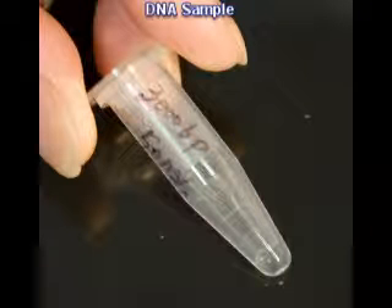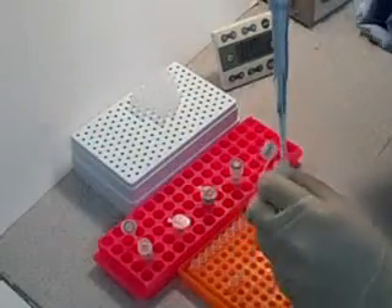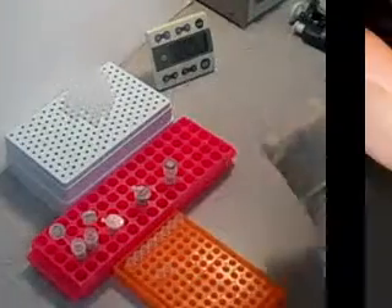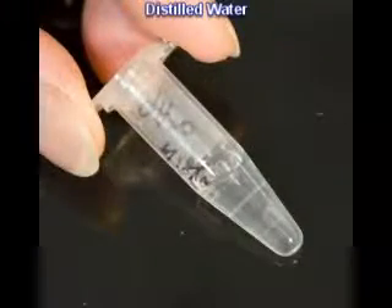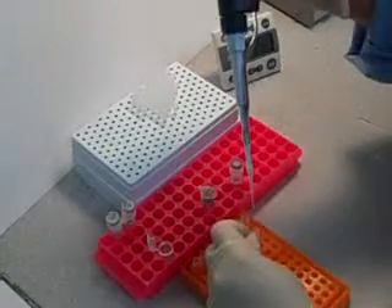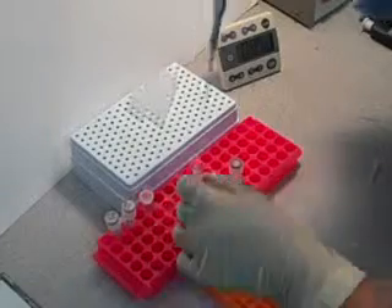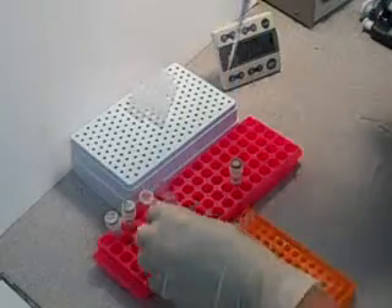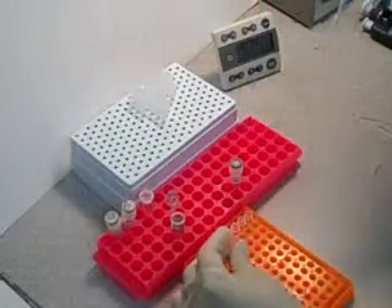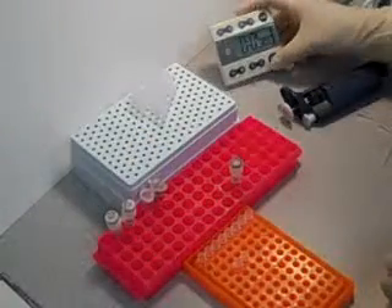This is our pre-staining procedure. First, start the mixture by adding the DNA samples into the microtubes. Then add DI water to make up to the final volume if needed. Next, add a volume of 5X SYBR Green dye that is one-fifth of the total volume, and give it five minutes to bind.